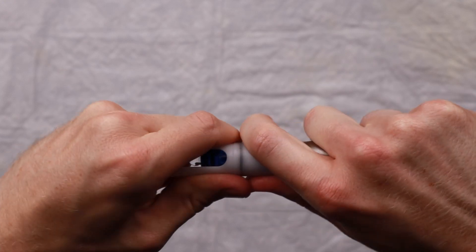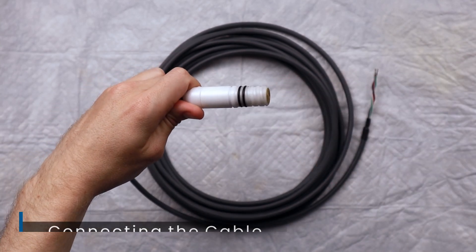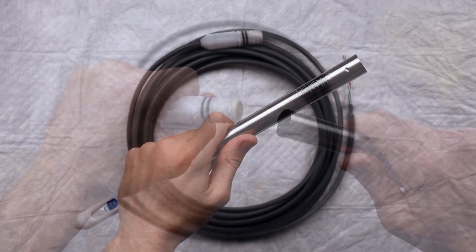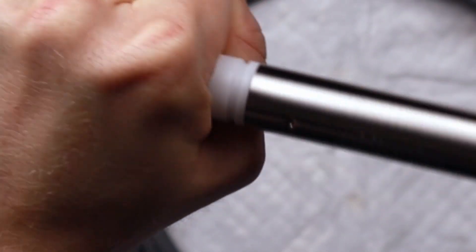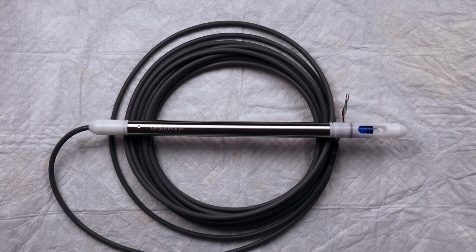We recommend saving the boot and using it whenever you wish to store the sensor. Next, we will install the cable. Remove the rubber guard on the connector as well as the remaining guard on the top of the sensor. Insert the cable connector into the top of the sensor, pushing in lightly and twisting to screw it in. Do not continue to apply force once the connector is flush with the sensor body, as this may strip the thread and make it difficult to remove in the future.